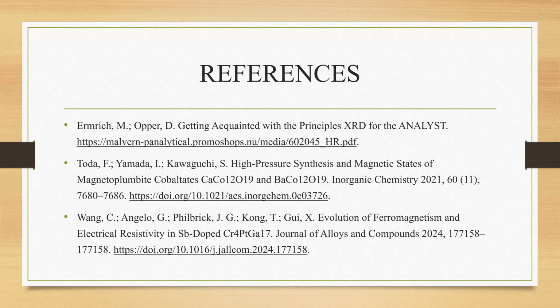And here is a reference. And in summary, powder XRD is a highly versatile and indispensable tool in solid-state chemistry.